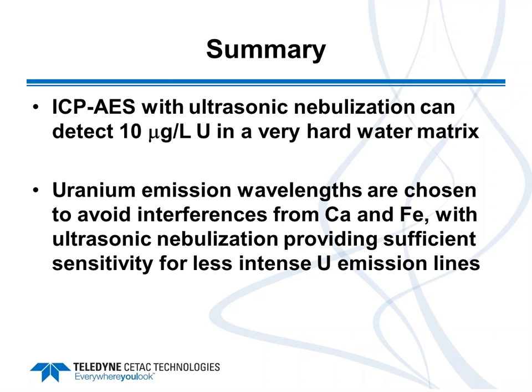If coupled with an ICP-MS, what sort of oxide ratio could you expect with an ultrasonic nebulizer? Cerium oxide to cerium? Yep. You will see similar ratios versus the standard pneumatic nebulizer. That can typically be, depending upon the spray chamber system you have, 0.5 to 1% cerium oxide, because even with the condenser in line, you will have water vapor that still goes out and gets into the ICP.